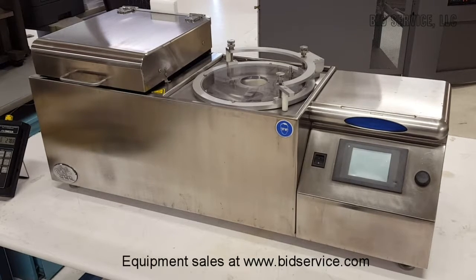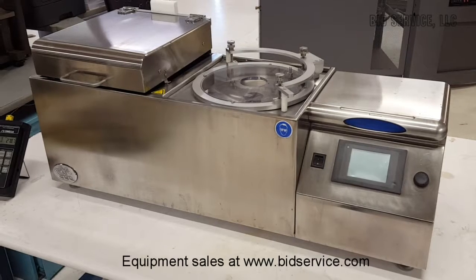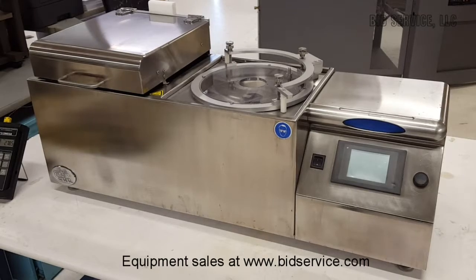The hot plate has a maximum temperature of 300 degrees C, and the entire system is powered by 120 volts AC single phase.